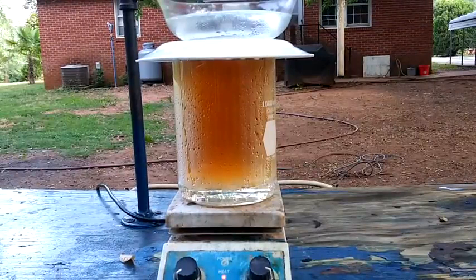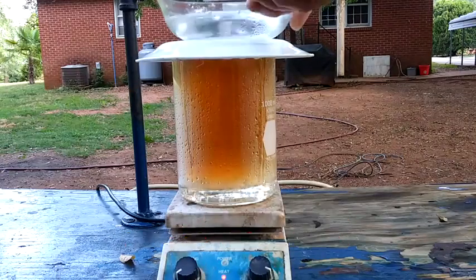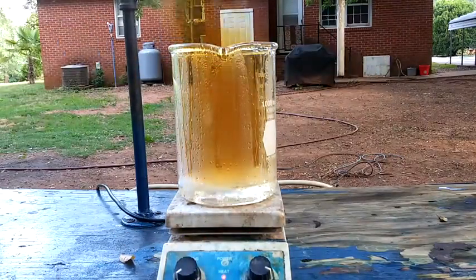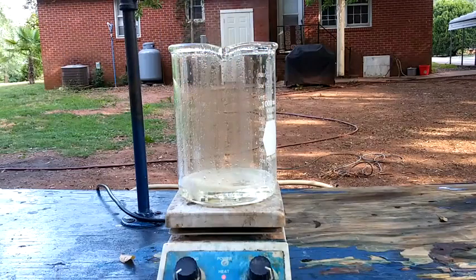Okay, so the bismuth is almost completely dissolved into the nitric acid, and because that's the case, I'm going to go ahead and take the top off of it. There we go, allow some of that gas to dissipate.